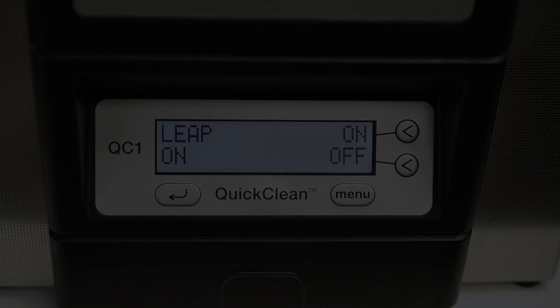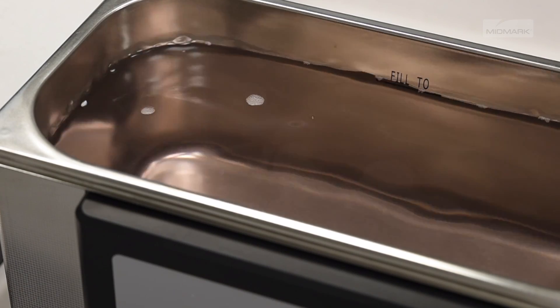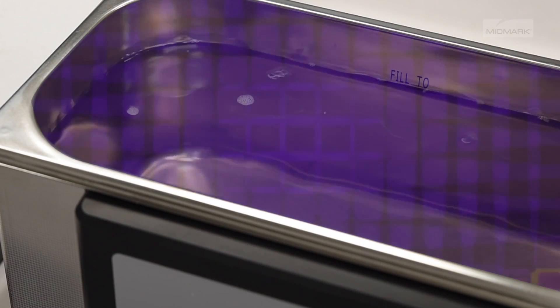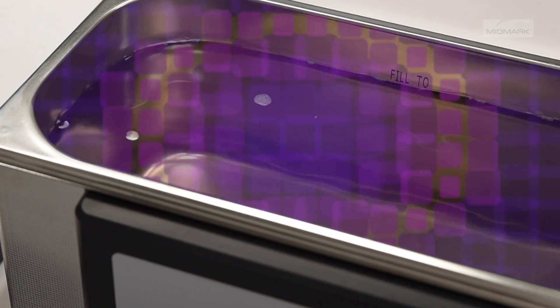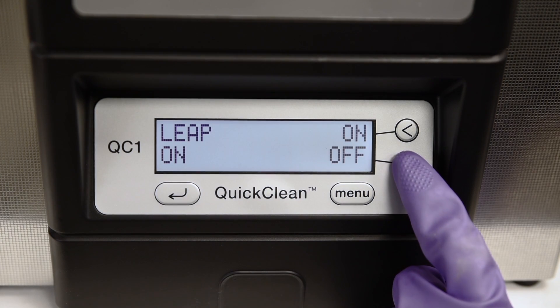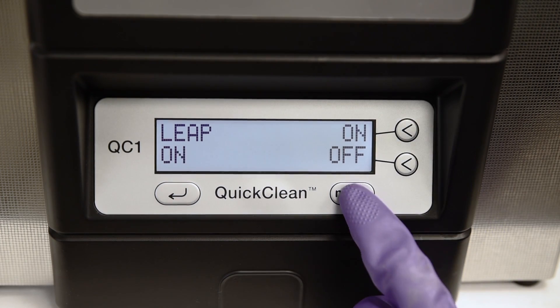Next is setting frequency leap. Frequency leap technology provides more homogenous ultrasonic activity throughout the whole tank. It uses advanced software and generators to create a pseudo-random leaping action between a wide frequency range, reducing standing waves and improving cleaning action. Your ultrasonic has a factory set leap function of on. The on setting means that frequency leap is automatically applied when the unit is turned on and is recommended for optimal activity. Use the on-off keys to set the leap function, then use the menu key to move to the next screen.